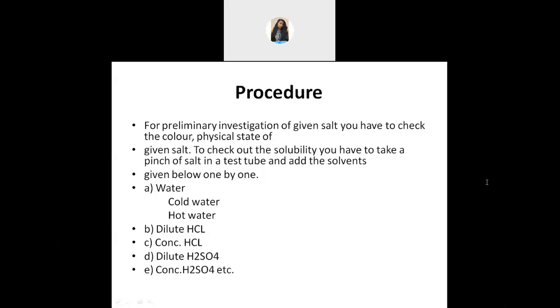Next, you have to see the color of the solution. After dissolving, the solution is prepared. So what color you found for that solution, you have to write down in your copy.